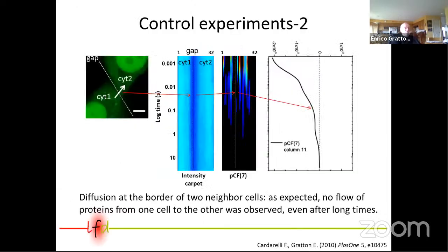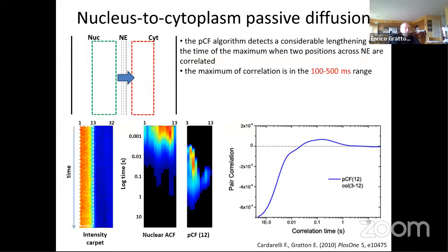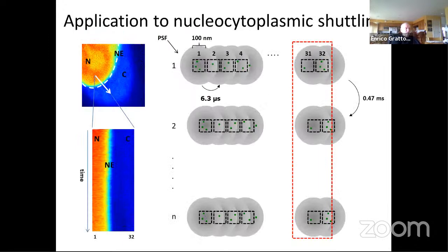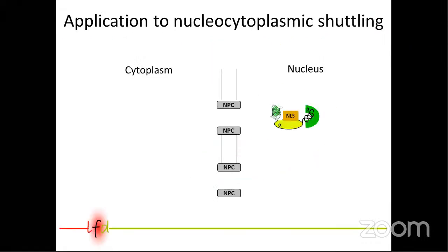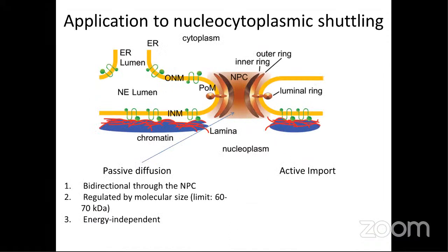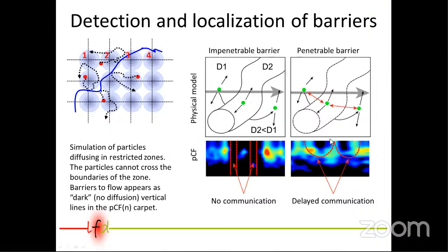If you want to look at the other thing I show in the other data, not simulation but data, for example, here, the previous one. The other point, Enrico, is that when you are cross-correlating two points, noise will never be cross-correlated. So essentially, I look at black lines because there is no connectivity. Exactly. Or lines which have circles.